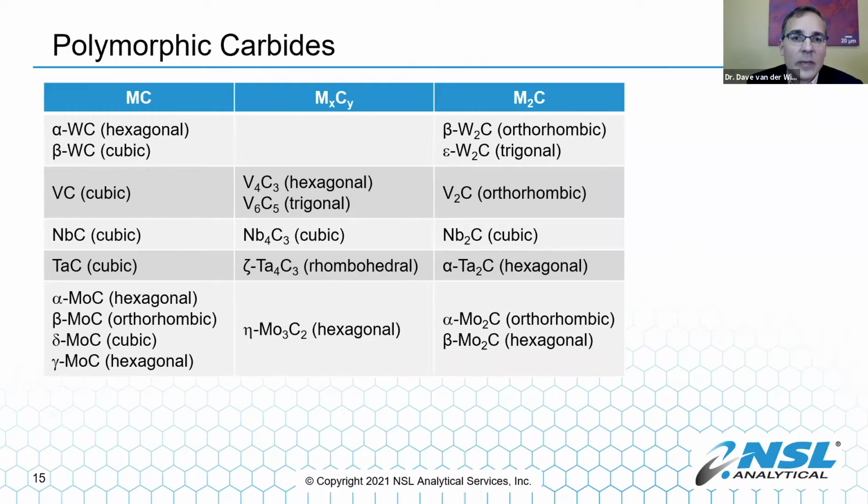Well, they also form in intermediate structures. So you look at vanadium carbide, for example, and you can see 2 more additional carbides. There's many more than this, actually, but 2 more fairly common ones that will show up oftentimes in applications where vanadium and carbon come in contact, such as in alloys and metals.